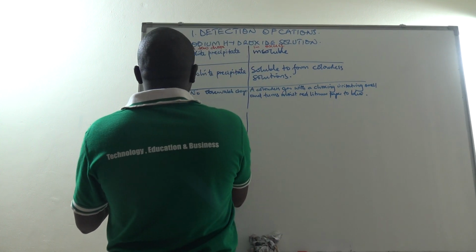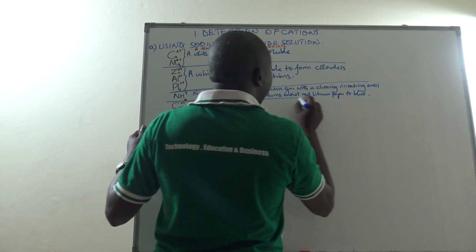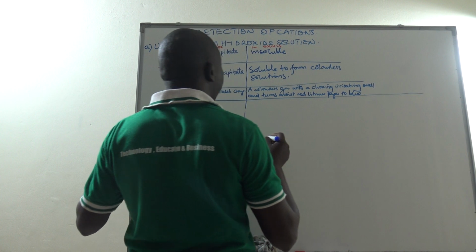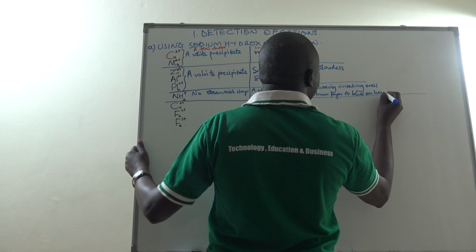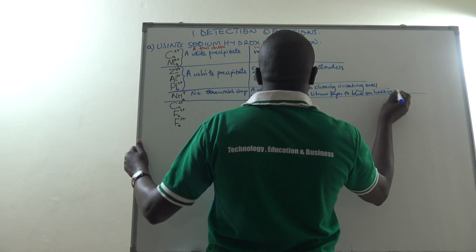If you have got this, just know that you have ammonia.